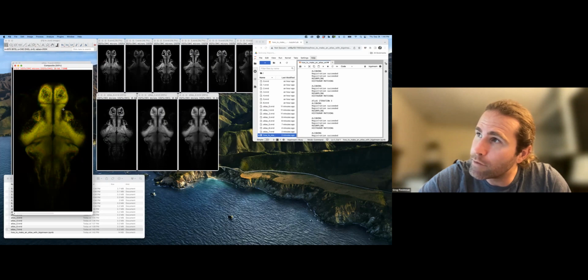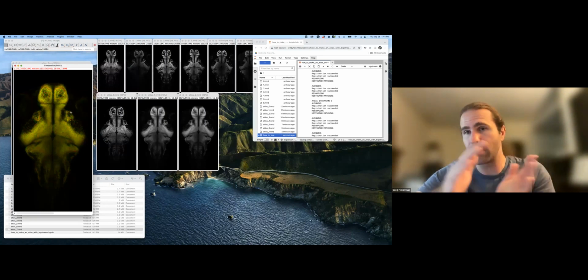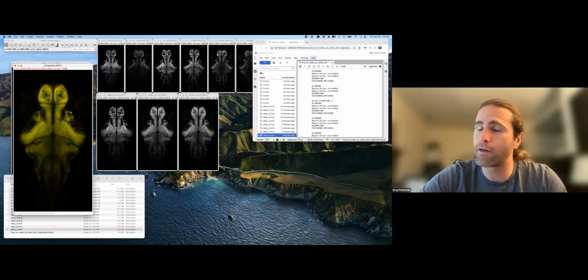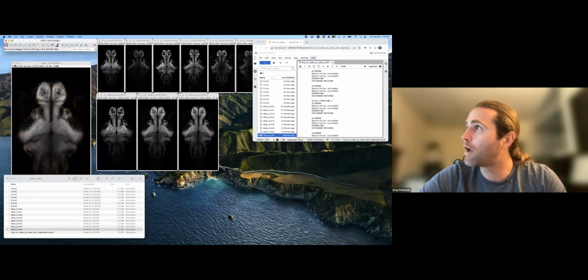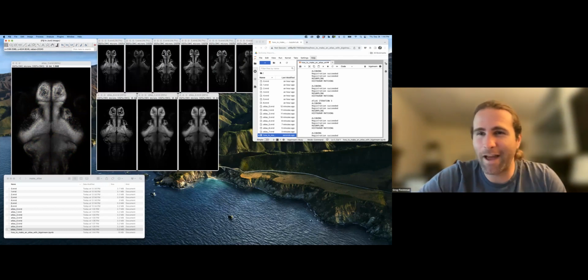I would say it was worth doing these extra iterations for structures like this, where you have a very thin structure, just a single layer of cell bodies or double layer of cell bodies, that was actually shifted to a new spot. That could be anatomically relevant for future studies, or it may be important to get that right. But I mean, that's pretty much it. I don't have a great conclusion, I guess, but that's how this all works.